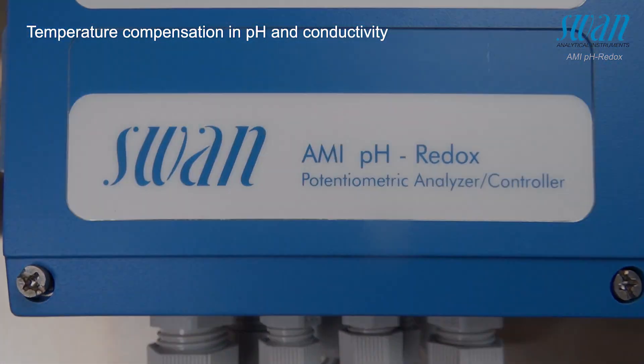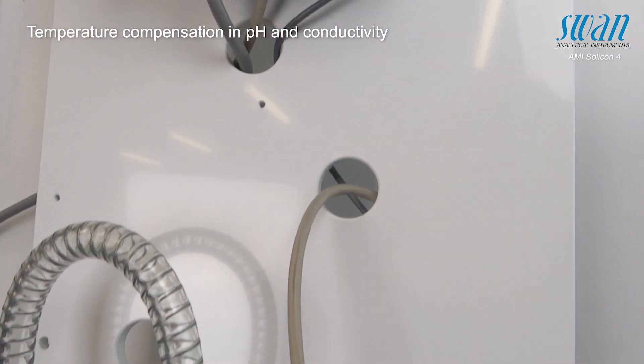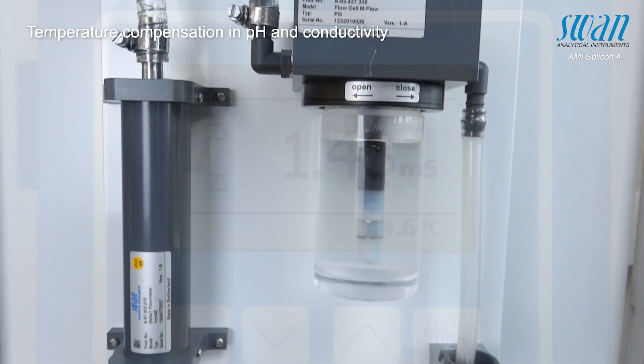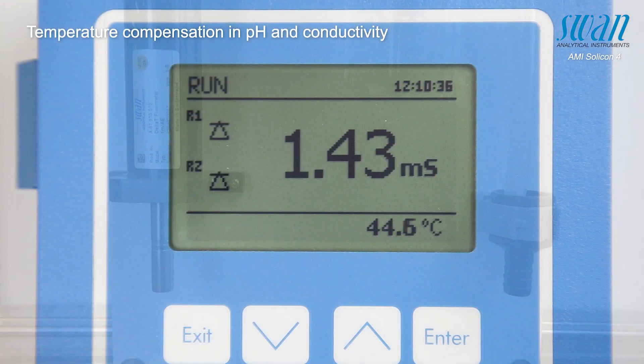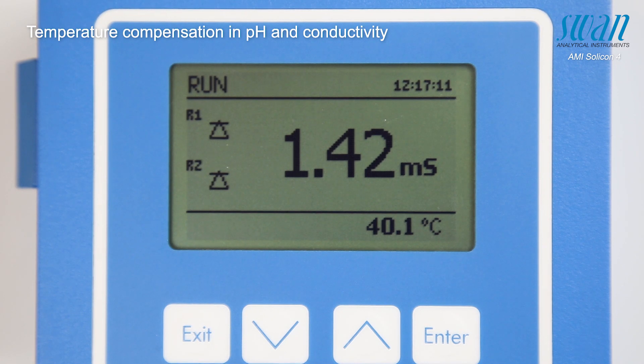Similar results can be obtained with the AMI Solicon 4. In this case, a 1.43 millisiemens per centimeter conductivity standard is heated to 45 degrees Celsius, after which it is left to cool down to 20 degrees.